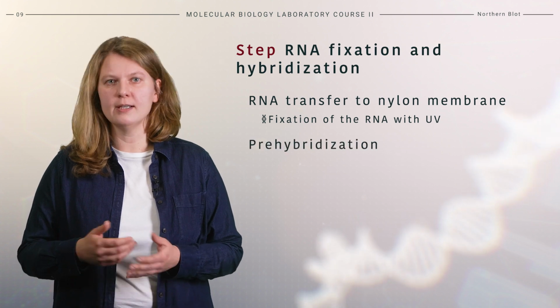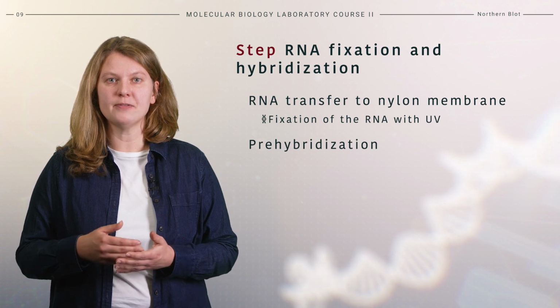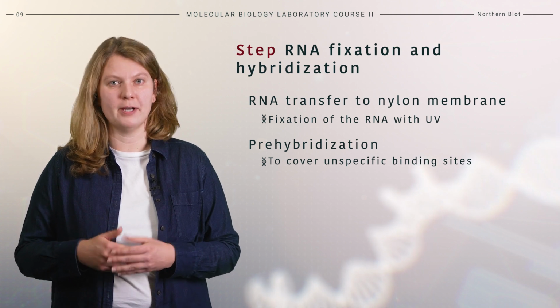Prehybridization, or blocking, is required before probe hybridization. This prevents the probe from coating the membrane. Good blocking is necessary to minimize background problems.